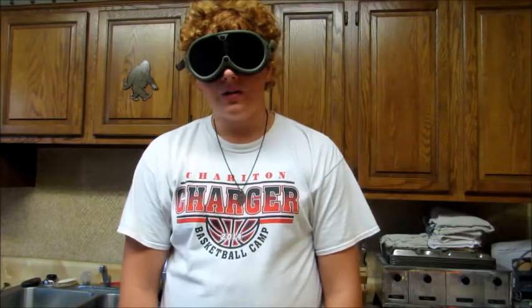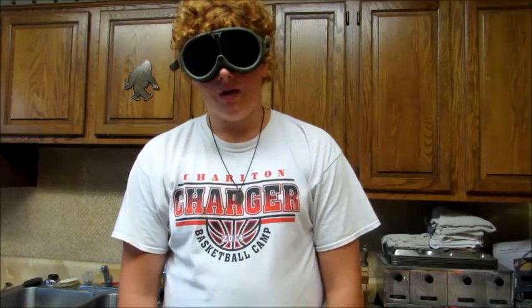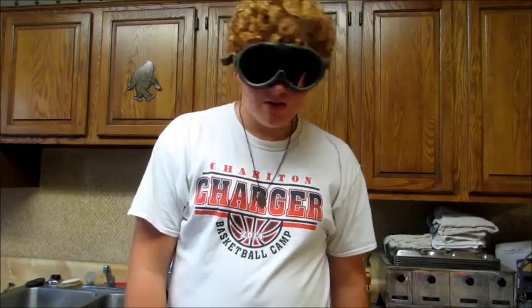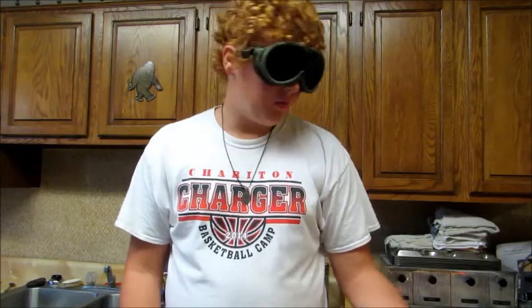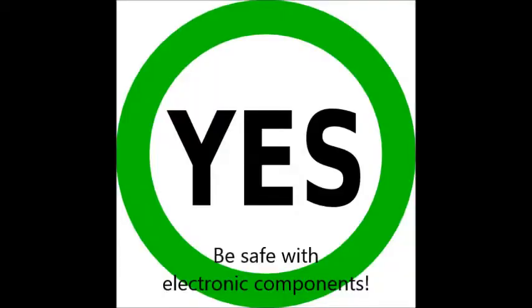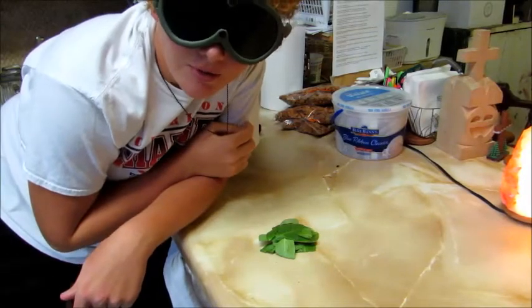Always act safe around electrical components. Always unplug them by grabbing the end of the cord, not the prongs, or pulling it out by the cord. And never get close to electrical equipment with frayed electric cords, with wet hands, or anything else. Or you might end up with the same result of putting an open lamp in a sink and running the water on it.